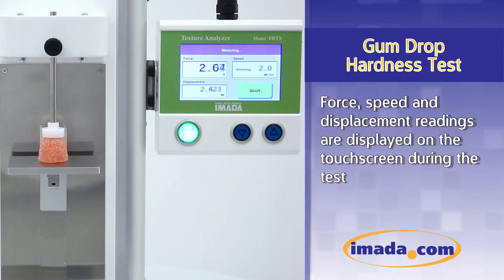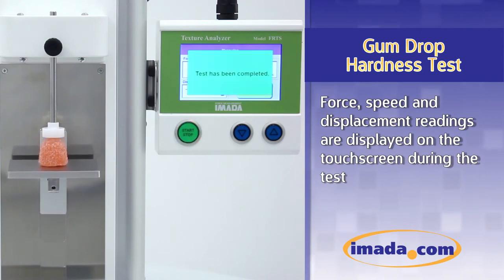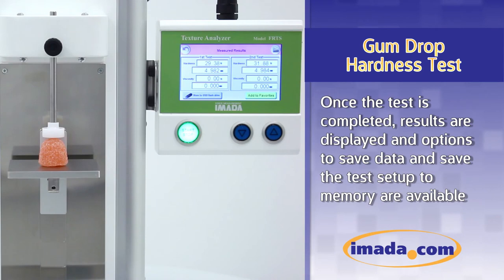Force, speed, and displacement readings are displayed on the touchscreen during the test. Once the test is completed, results are displayed and options to save the data and save the test setup to memory are available.